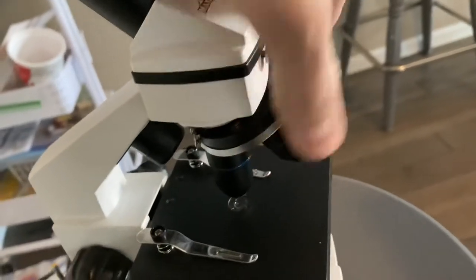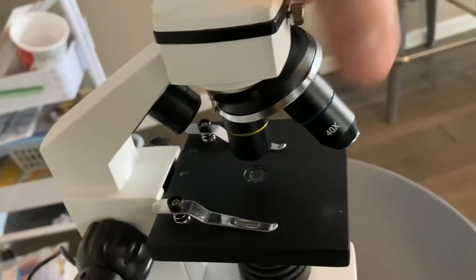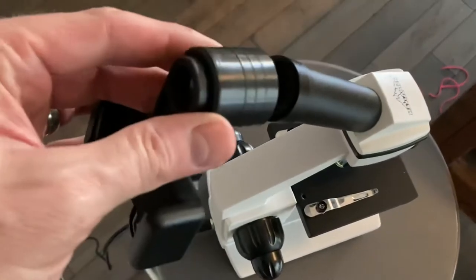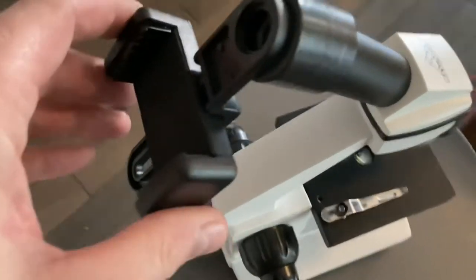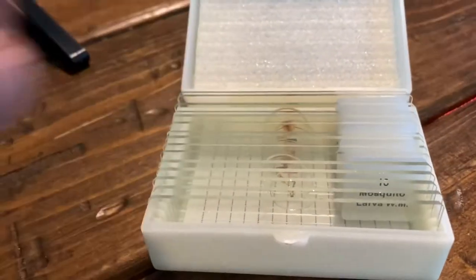We're going to get this hooked up to the phone in a minute — you can actually use your phone with this microscope. You can rotate your lenses, and the stage clamps look good so you can put your slides in and they'll stay in place. There's a little plastic phone adapter that lets you adjust the angle, and it appears to fit all kinds of different phones. I have an iPhone so we'll go ahead with that.